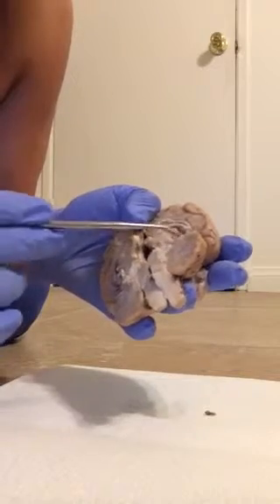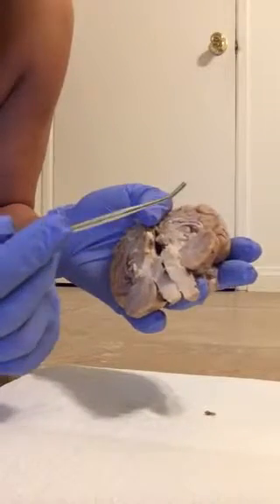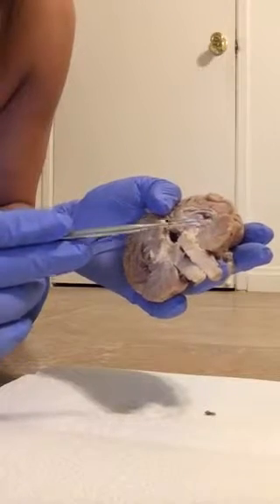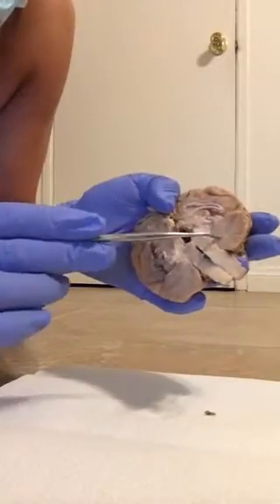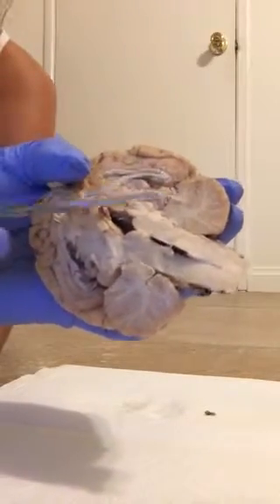And of course we have the pineal body again, which is also considered the epithalamus. I'm just going to focus our attention on the cerebellum, which has tree-like branches here. Those are considered your arbor vitae.